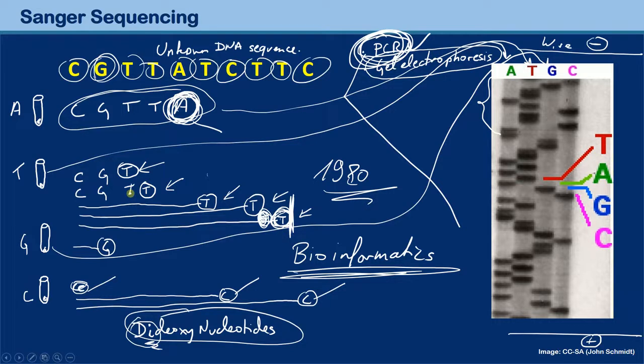So it is a very useful technique that is used very much in molecular biology, but nowadays I think nobody actually does this by hand anymore. You have machines that do that for you.